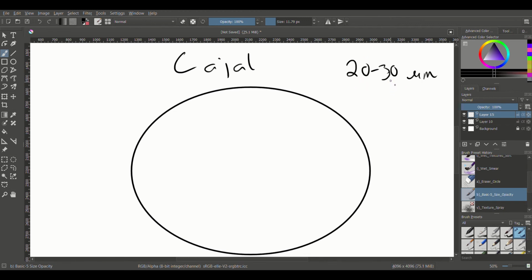So it's pretty thick. To get astrocytes, that would be my guess as to why that is so thick, is they can be fairly thick pieces, functional pieces. So probably to try to make sure we don't cut through it and stop it from having its absorptive properties, which is what we're going to rely on here. So we cut it, and then we're going to fix it in formalin ammonium bromide for at least 2 days, but no more than 25 days. So as you can tell, this probably isn't a very speedy method of seeing these astrocytes, but apparently it works.